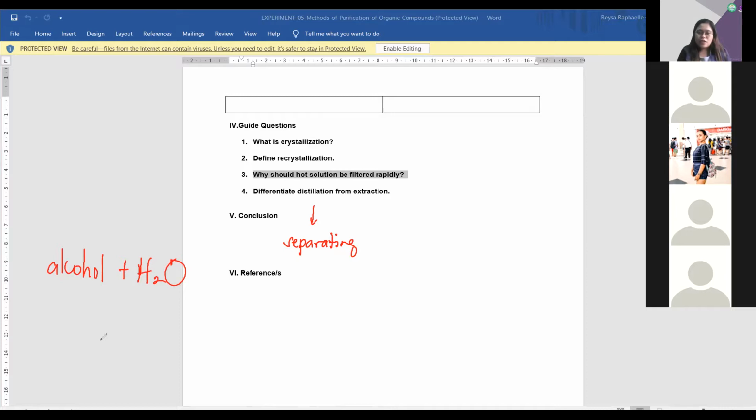So yung distillation setup, na I think na-present ko yan during the activity number 1. Example, you have the flask here. Lagay mo dito yung solution ni alcohol plus ni water. Subject mo siya sa heating here. And then after heating, mag-e-evaporate kasi yan. So kung sino yung una mag-evaporate, yan yung una mong ma-separate. So mag-e-evaporate siya as gas. So ang gas, papasok yan siya dito sa, we call this condenser. So dito, ang temperature niyan ay low.